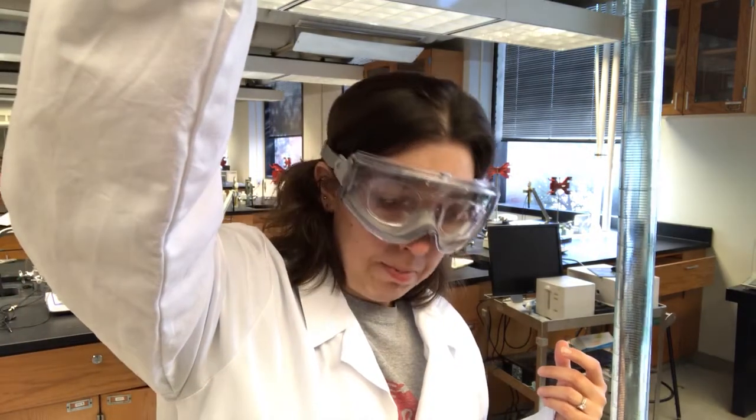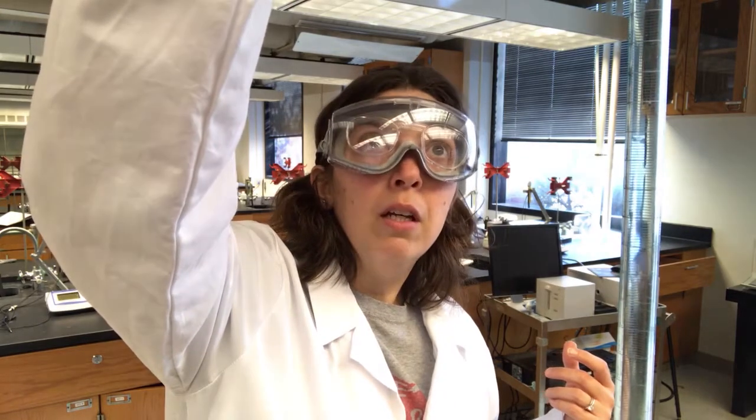Now we're ready to take a measurement. We're ready to do some experiment. So I'm going to make sure the stopcock is closed and fill up my Buret. You may want to use a funnel to do this if that makes you feel more comfortable.